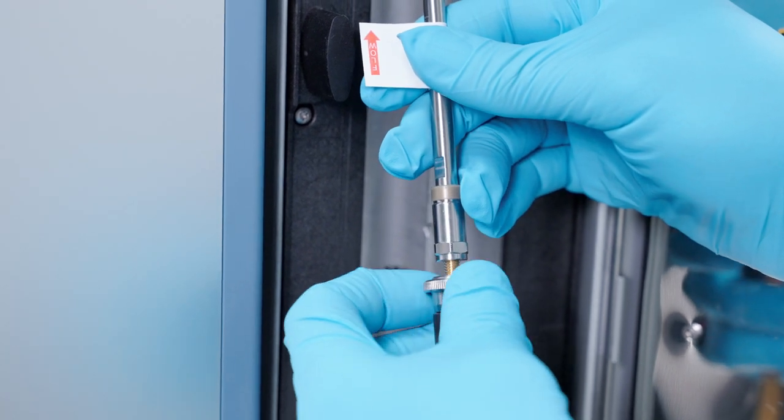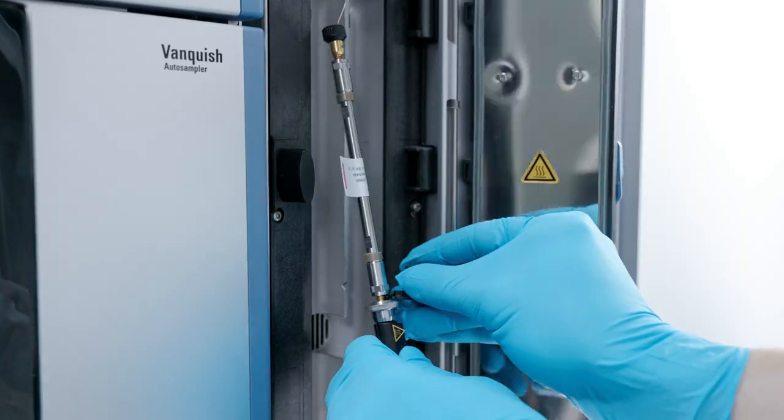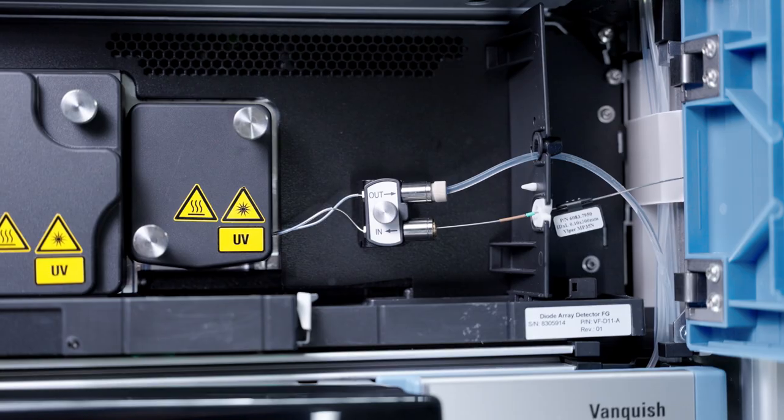Thermoscientific Viper finger-tight fittings simplify making leak-free, near-zero dead-volume connections to reduce peak dispersion from injection to detection.